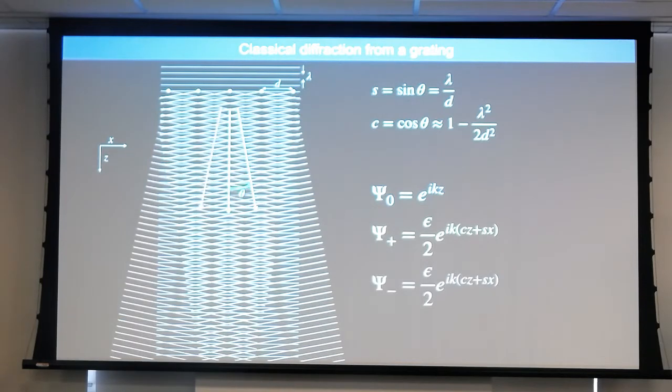So in fact, the complete description says we have our unscattered wave and we have these two scattered waves that I call psi plus and psi minus, and the two scattered waves go off in mirror directions. So what I want to ask is what happens as far as interference among these waves. There's going to be an interesting interference situation, because if you look here, all three waves converge in these vertices, but if we look down here, all those three waves do not converge in the same vertices, so there is something happening to cause a phase shift as we move down below the specimen.